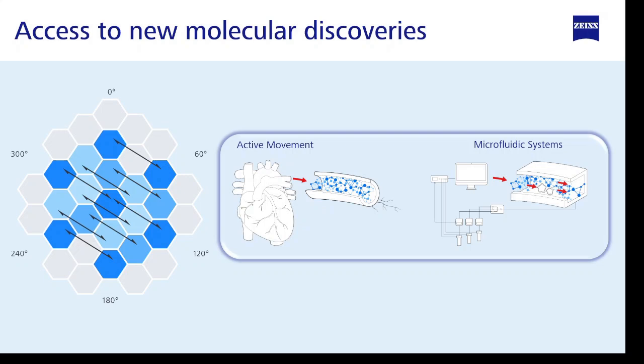In this, the area scan detector is not used as a single detector. We now use it in a different way. We use two detector elements as a pair and correlate them with each other. This is called cross correlation. From this cross correlation, we can know, if we see molecules passing through one detector element, whether we can see them passing through another detector element a little bit later.